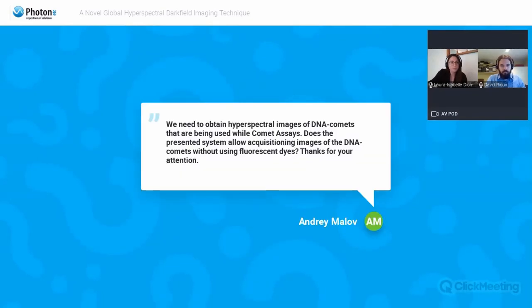Okay. So we got a question from Andre that says, in your group, you need to obtain hyperspectral imaging of DNA comets that are being used while comet assay. Does the presented system allow acquisition images of DNA comets without using fluorescent dyes? Okay, so thank you, Andre, for your question. David, can I leave this one to you?